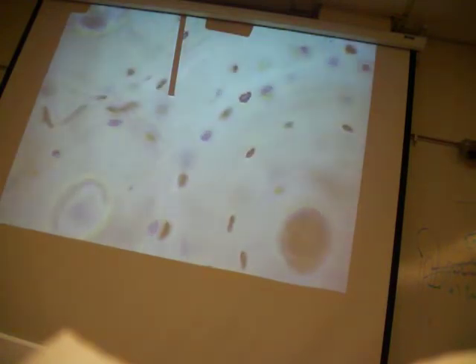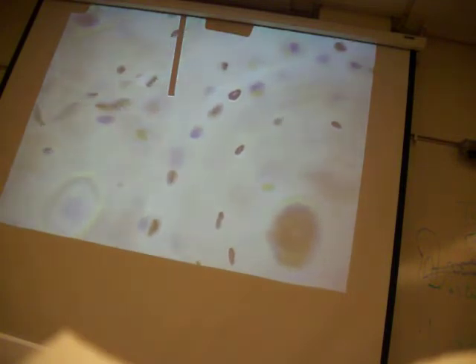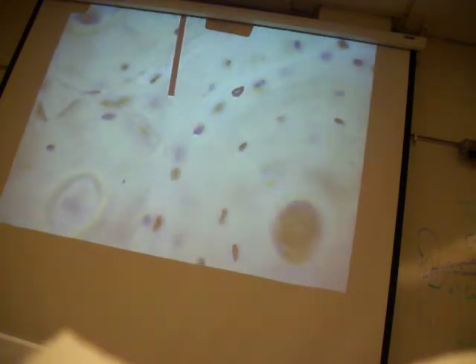You can see a little bit. There's one right here, right, that you can actually see. You guys see that little thin thread? That's a canaliculi. All right. There was something back here that I wanted to show you.